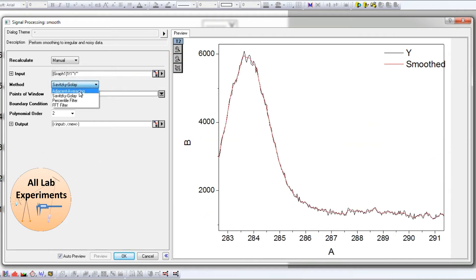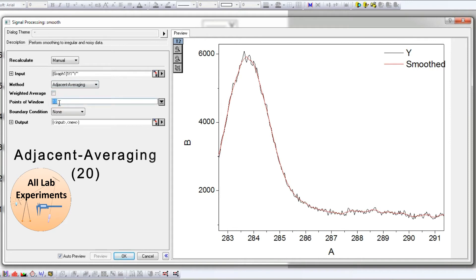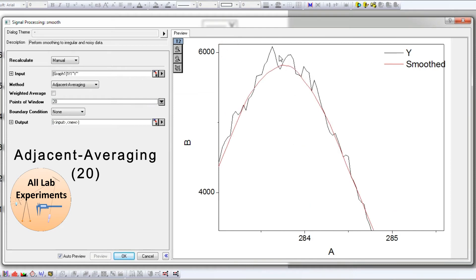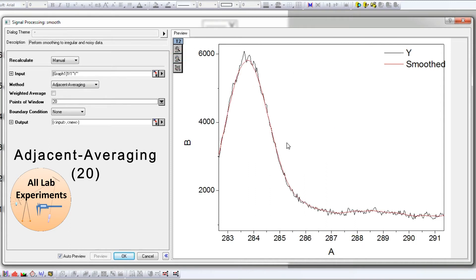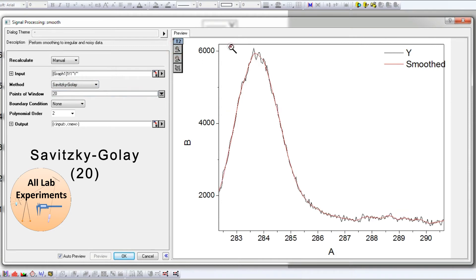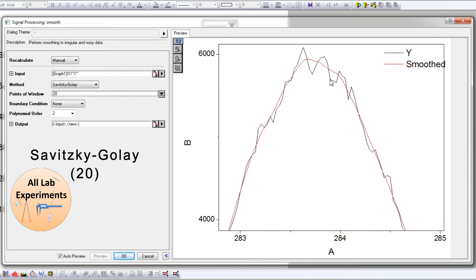Now for the same Adjacent Averaging, if I switch to 20, you will see that this peak is coming a little bit down from the original data. The smoothing process is OK only up to a limit, up to when you don't lose the information out of your data. This is getting off in this case.